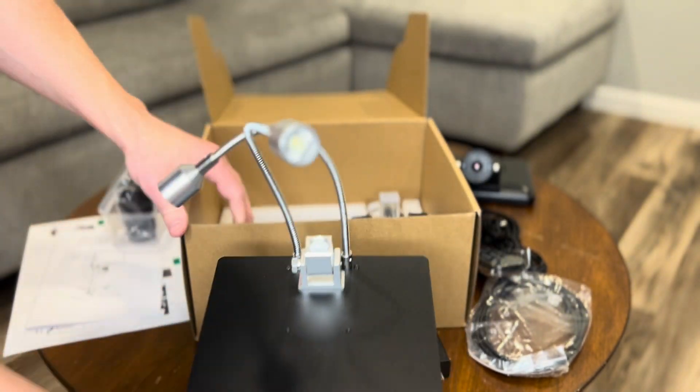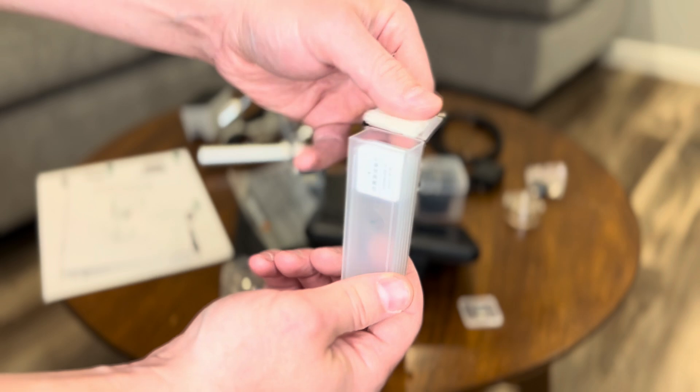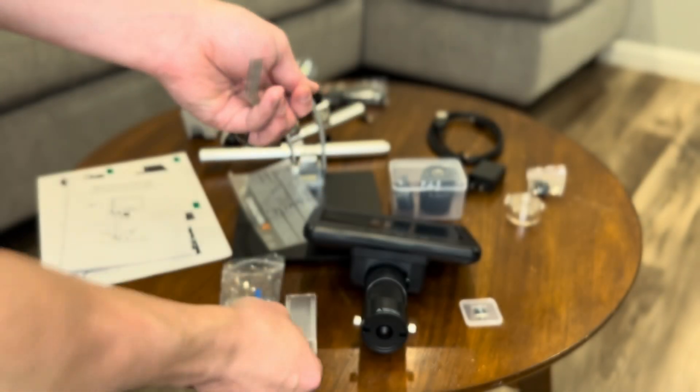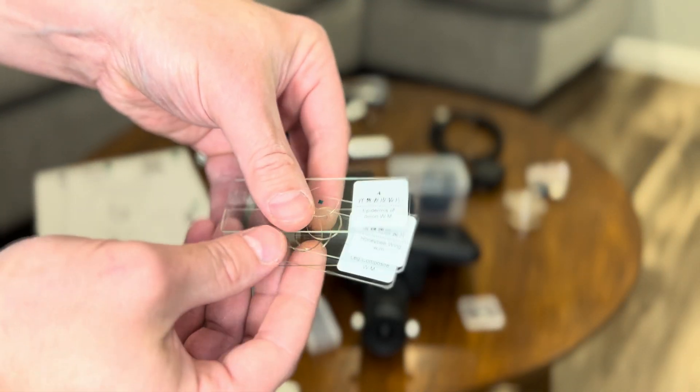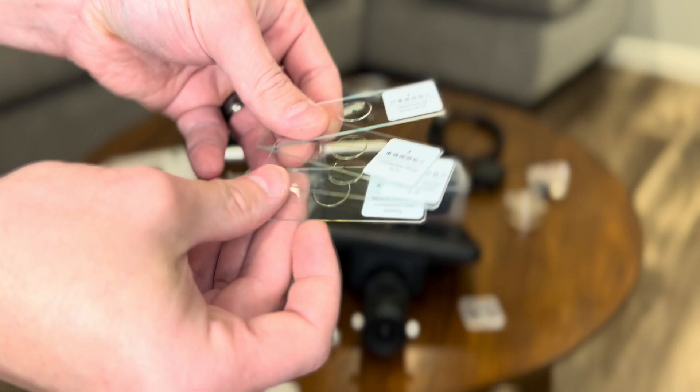And lastly, we have some sample slides to get us started. This comes with five different slides: a housefly, a honeybee worker leg, a honeybee wing, the epidermis of an onion, and a pine stem.